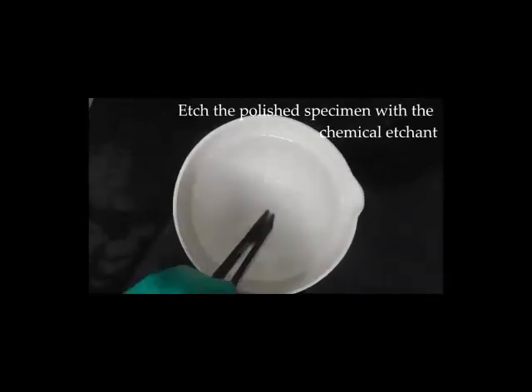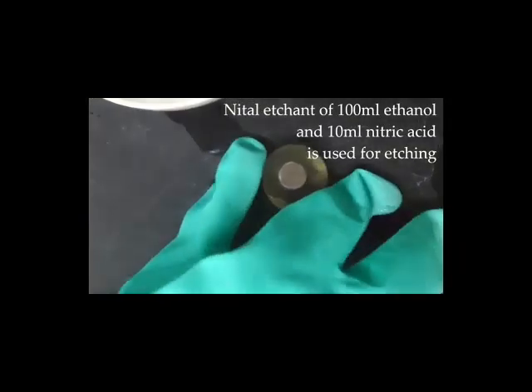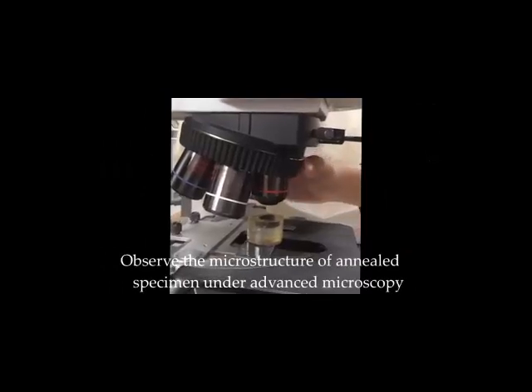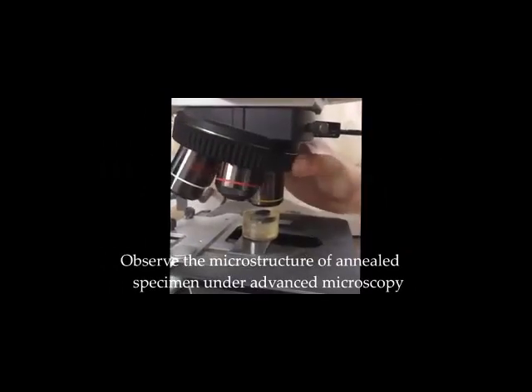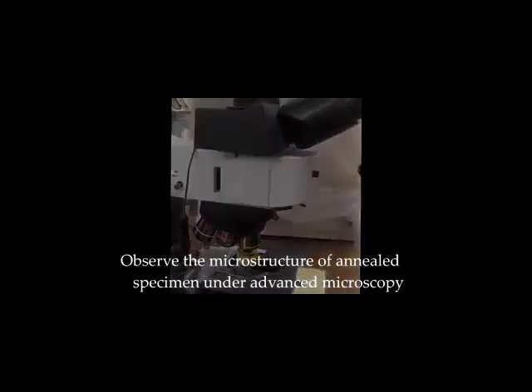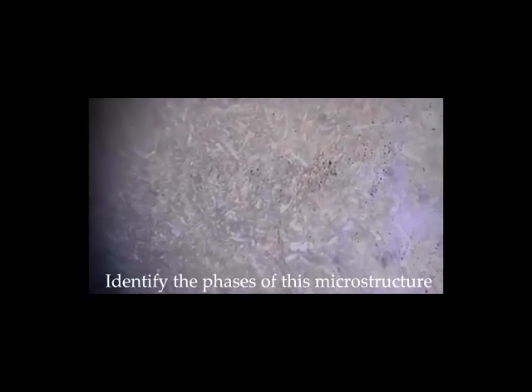Etch the polished specimen with the chemical etchant. Nital etchant of 100 ml ethanol and 10 ml nitric acid is used for etching. Observe the microstructure of the annealed specimen under advanced microscopy. Identify the phases of this microstructure.